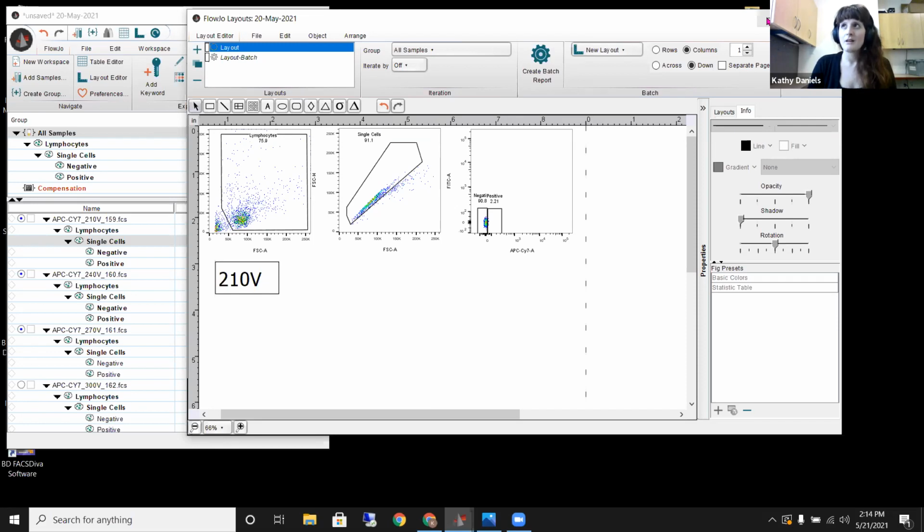But if it were up to me and if it were my experiment, I would probably try and work on my specific cells to make sure I have the best separation. Yeah, I think if you're doing lymphocytes, it's probably reasonable to do it like that. If you're getting anything different, it possibly isn't. Yeah, exactly. And especially for cells that have varying levels of autofluorescence, where it might be a little bit tricky, definitely try and optimize with the cells.